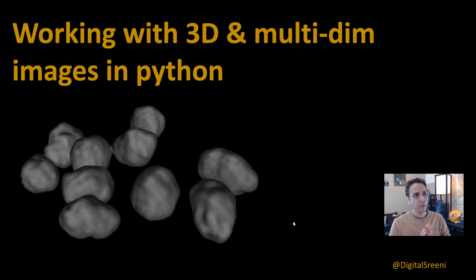Now, let's get into today's topic, which is working with 3D and multi-dimensional images in Python. I'm recording this because quite a few of you have requested this specific topic, especially in the comment section of Gaussian filters and denoising filters. I see quite a few asked, what about multiple images and what about 3D images and so on? So this is a quick video talking about how you load these multi-dimensional images, and how you work with them.